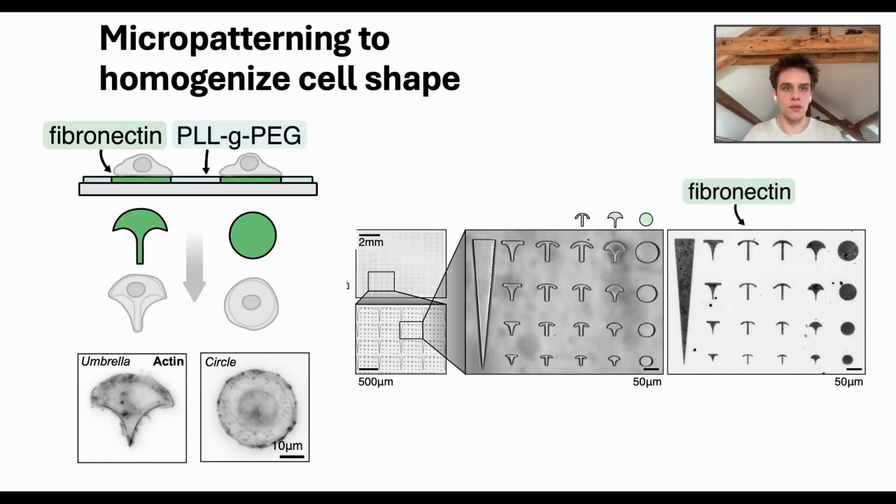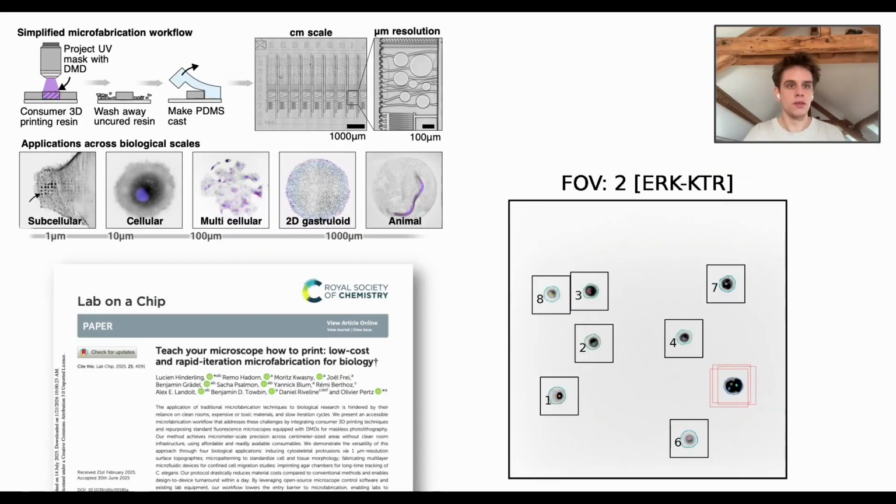We didn't invent this, of course. This is a classic technique that is widely used, but we did some work on the protocol. So I tried to repurpose our existing microscopes for optogenetics, but for 3D printing. You can hack your microscope to work as a 3D printer. Instead of projecting light for the optogenetics, you project UV light that you can then cure.